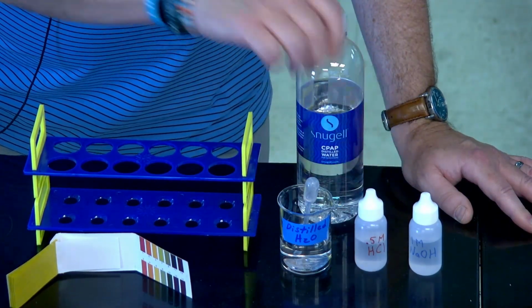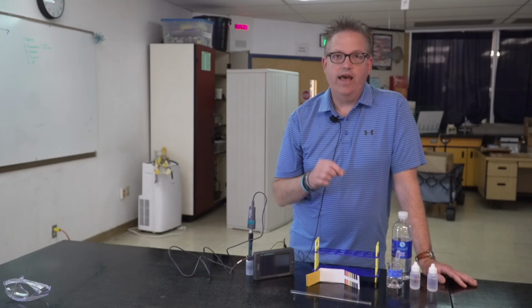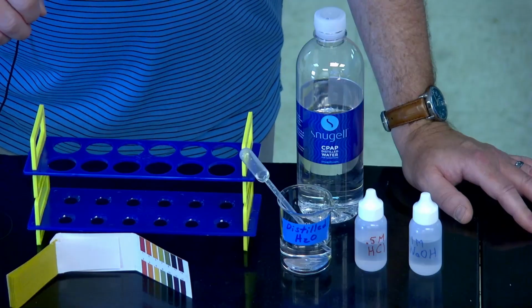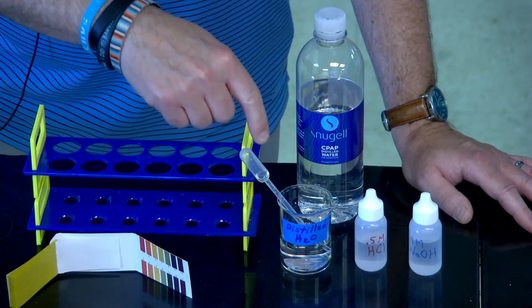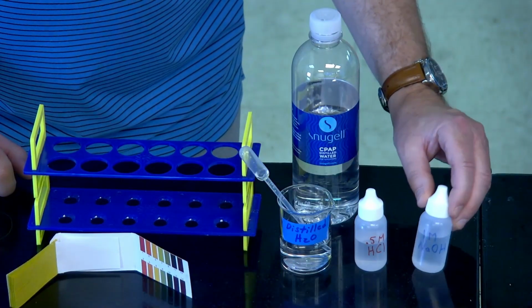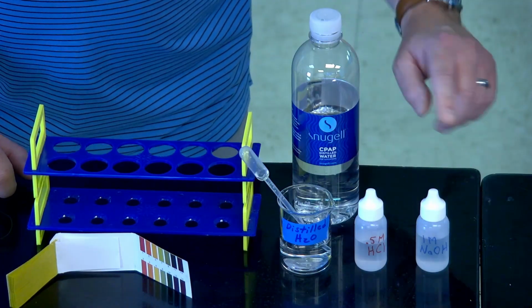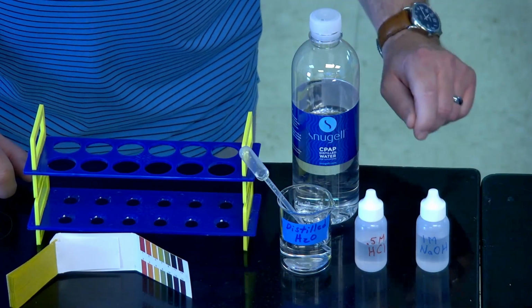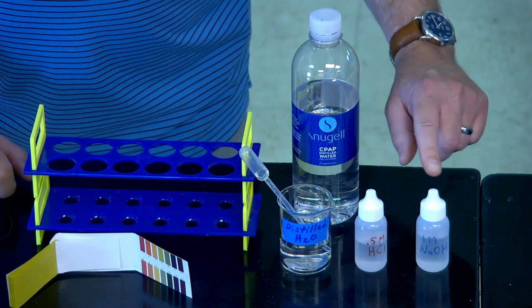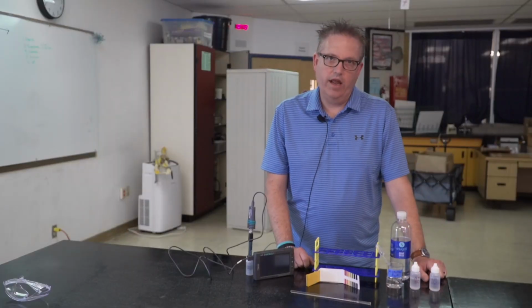And then for the pH 7, which will be represented by test tube C, that middle test tube, we will try to create as close to 7 as possible, which is a neutral pH, using distilled water. And then to create a basic environment, we will use varying amounts of sodium hydroxide. It might be important to note that we're using 0.5 molar hydrochloric acid and 1 molar sodium hydroxide. So they are not the same molarity.